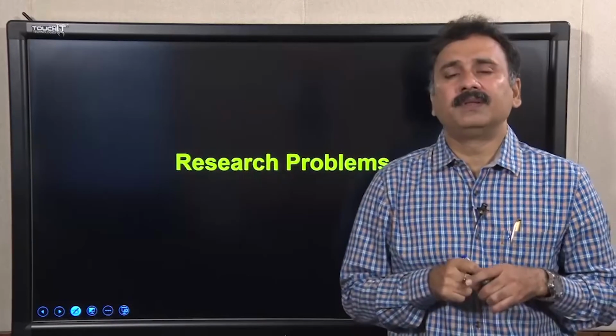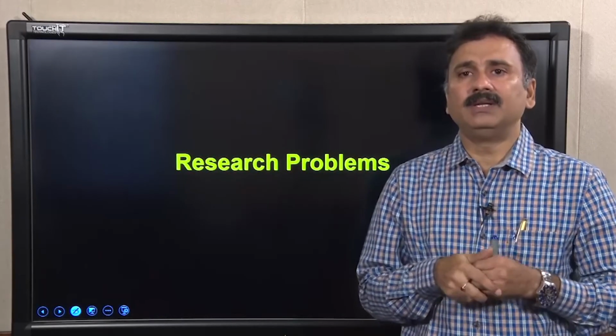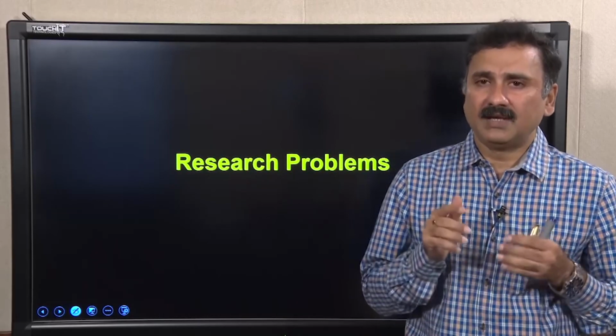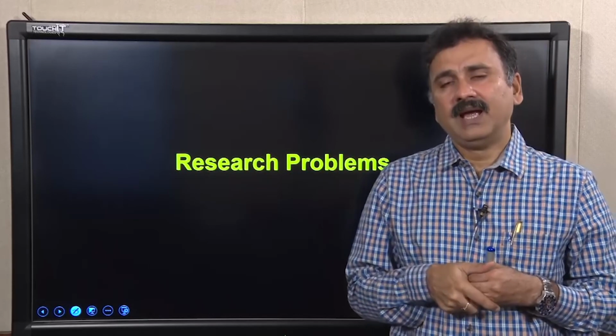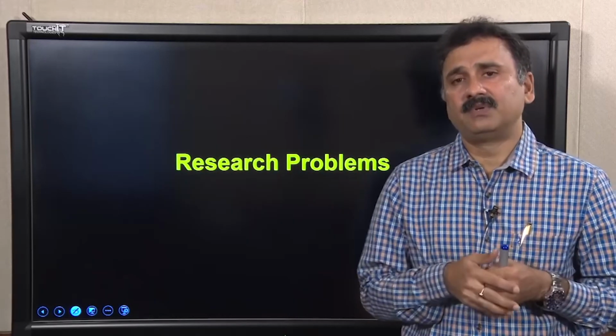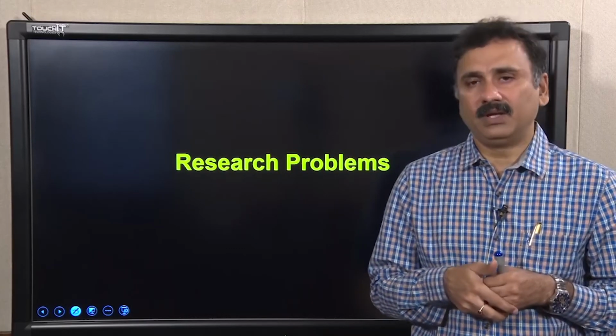Now, in our subsequent lecture, we are going to discuss research problems where you can utilize ion exchange chromatography, and how you can design different types of experiments exploiting ion exchange chromatography.